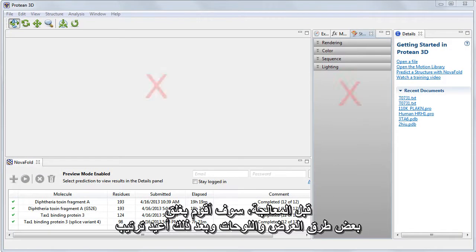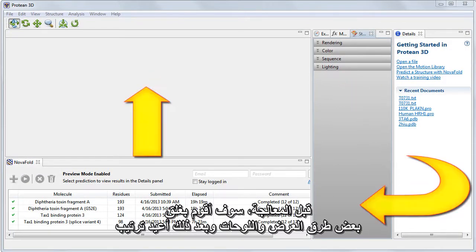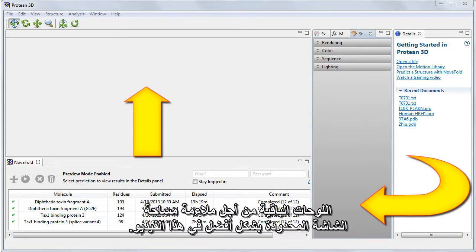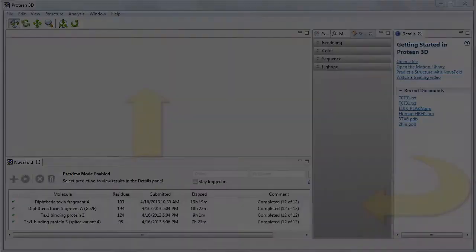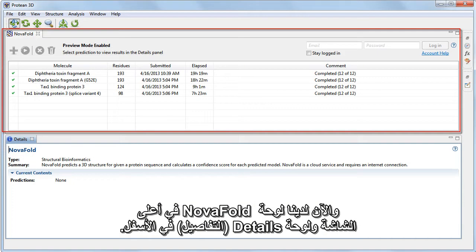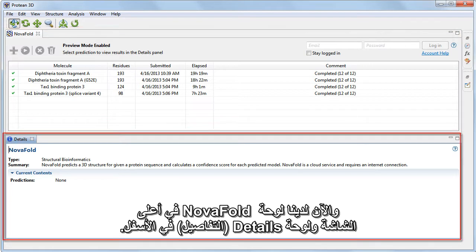Before proceeding, I'm going to close some of the views and panels, and then rearrange the remaining panels to better suit the limited screen space in this video. And so now we have the NovaFold panel on the top and the Details panel on the bottom.